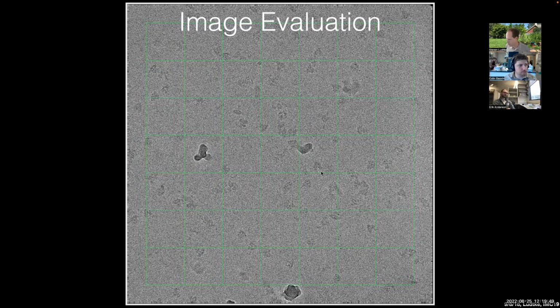And the protein doesn't degrade at all. There's no little bits of protein floating around in solution or anything else. That you basically have pure ice, pure water ice with protein molecules floating around in random orientations. That's obviously nonsense, right? We have obvious aggregates and stuff like that. And there's all sorts of other little lumps that you see floating around. That's not flat band random noise. That's other junk floating around.